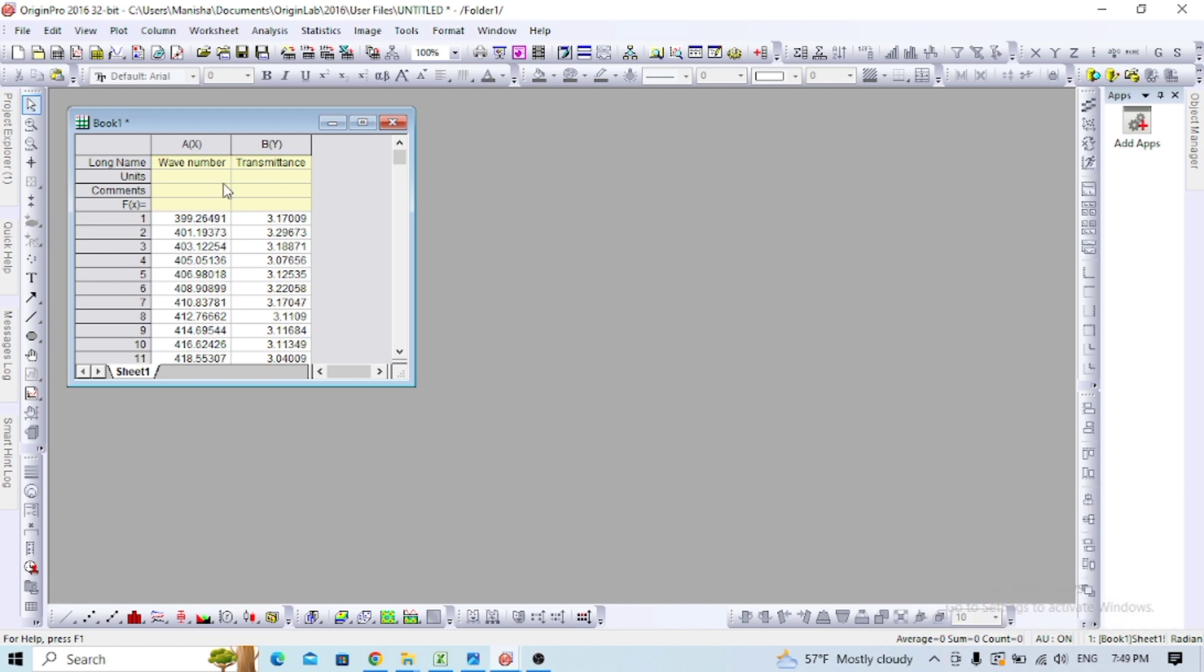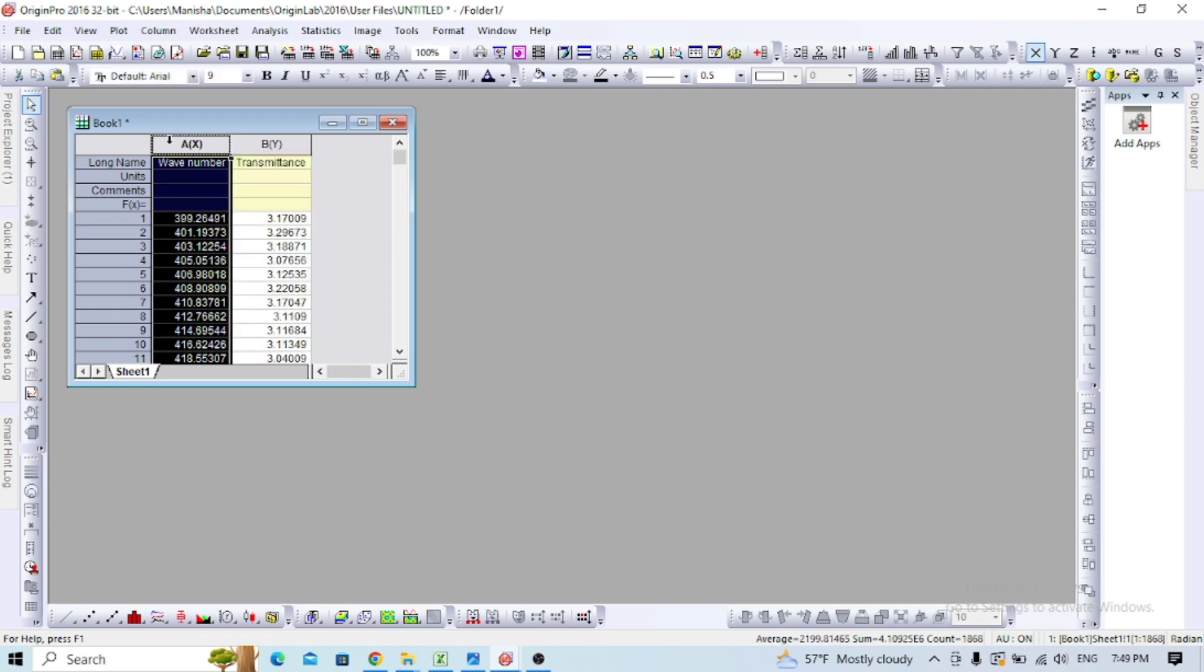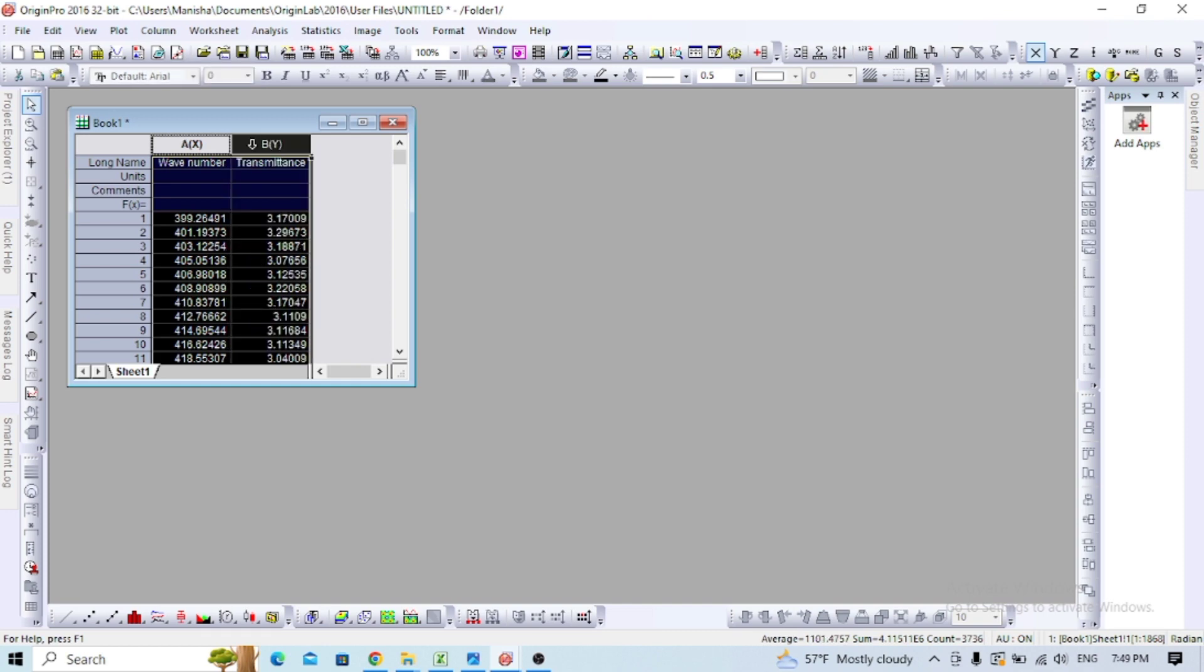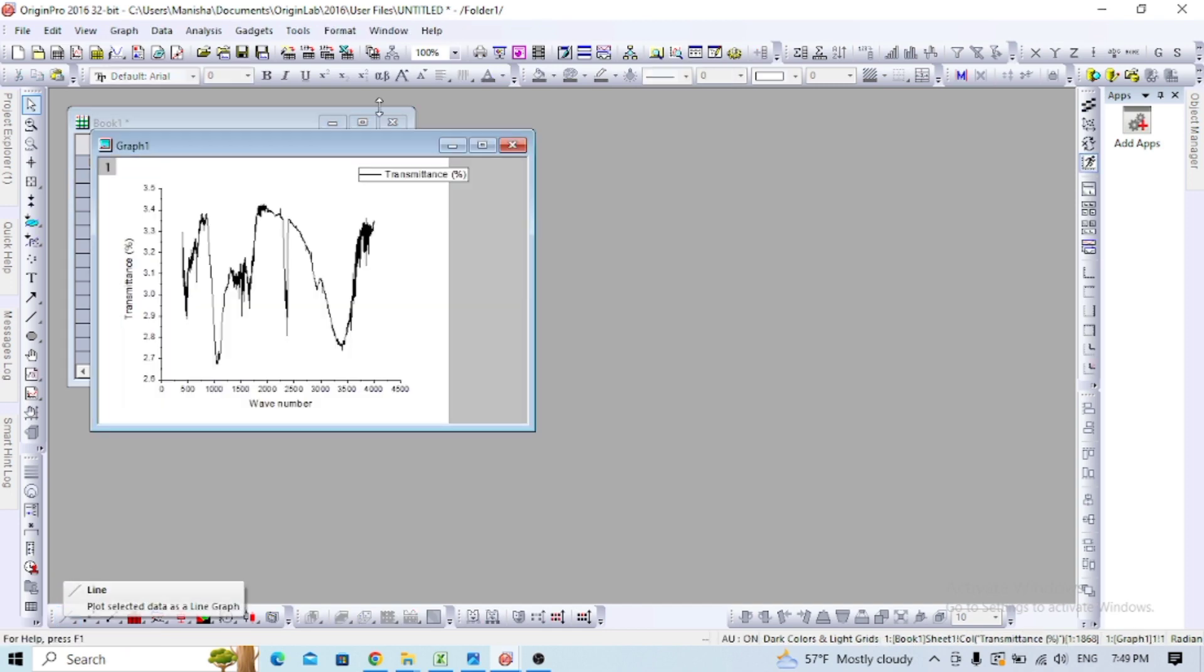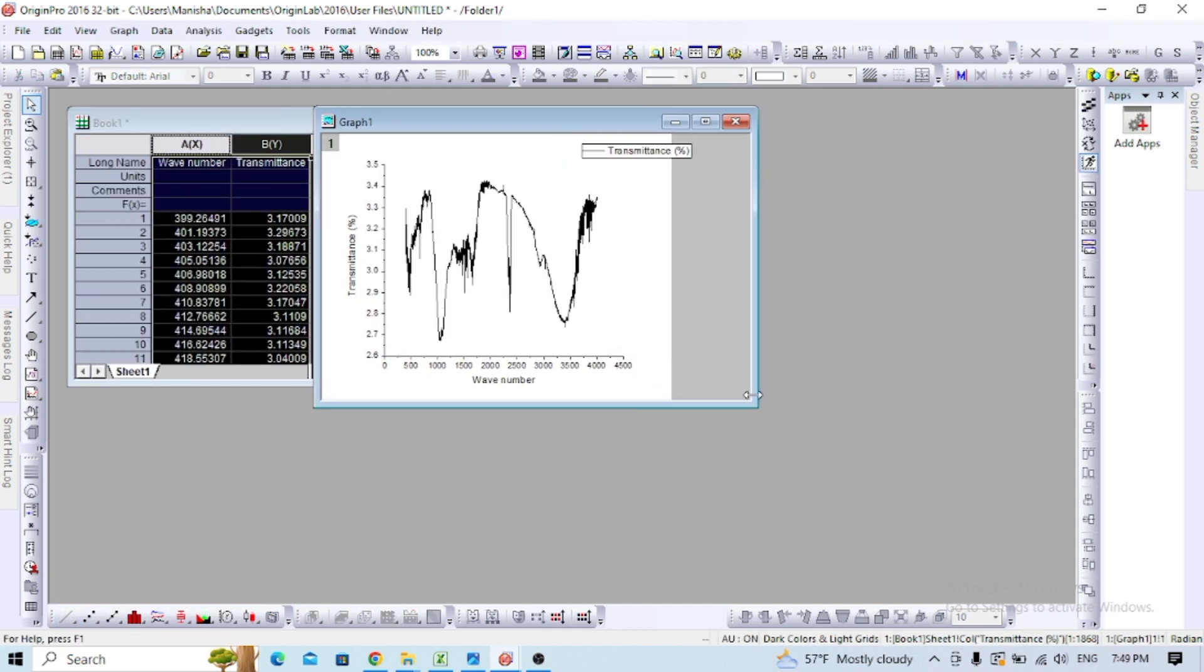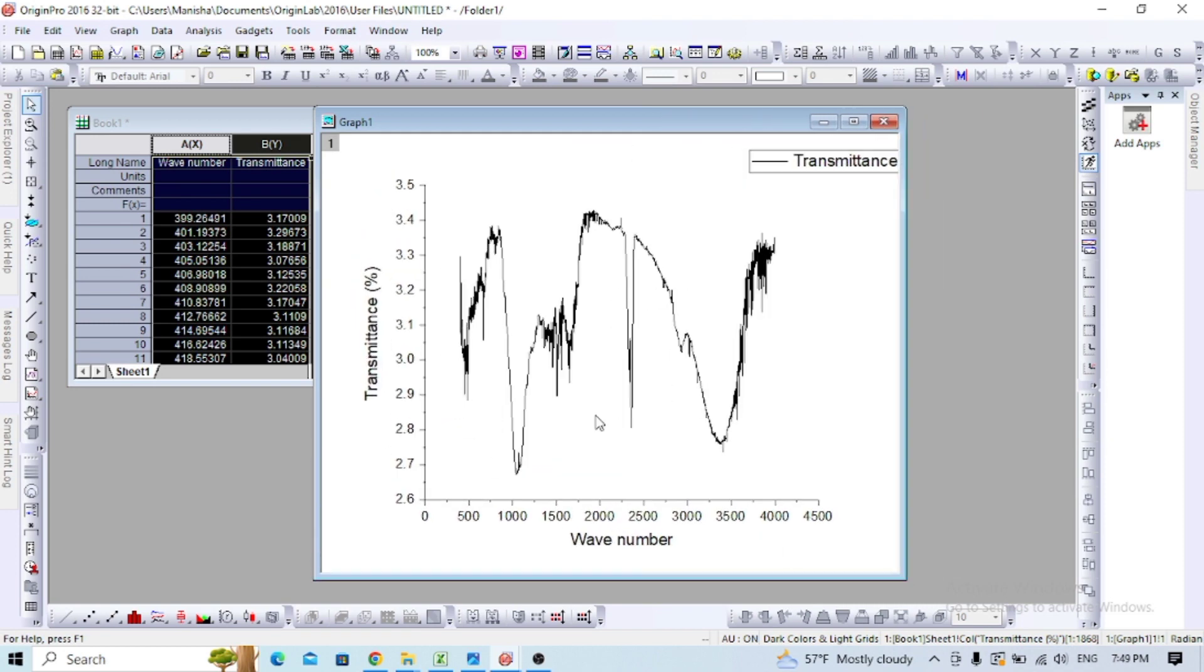I already have wavenumber and transmittance data for one absorbent. Now I'll make a line graph. This is the raw data form, which looks like this. This is not a good way for presentation, so I'll do baseline correction.